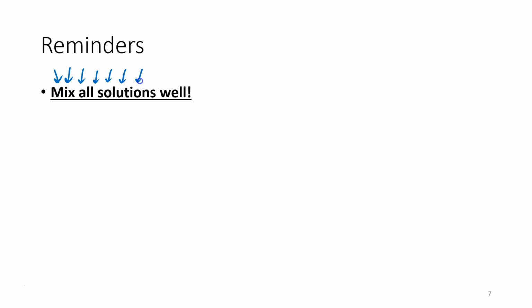So some reminders: mix all solutions well. I cannot stress how important this is. Even if you've prepared a solution, you've mixed it, and it's sat aside for only 5 minutes, mix it again. You won't believe what a difference this makes.